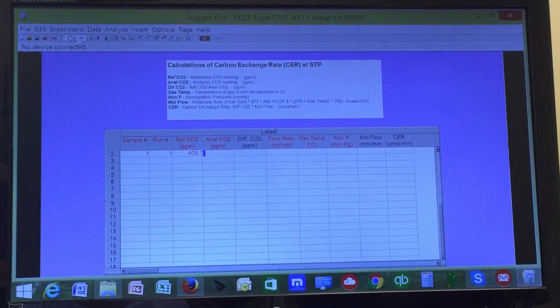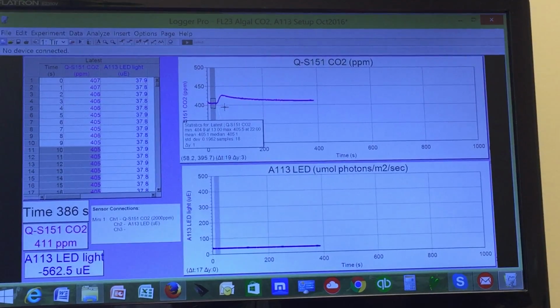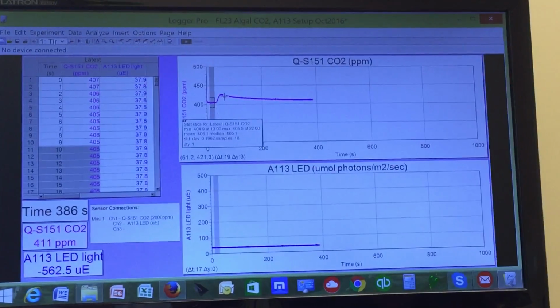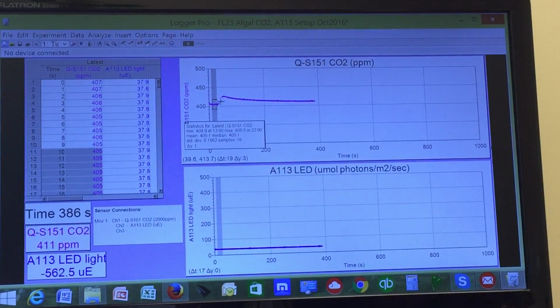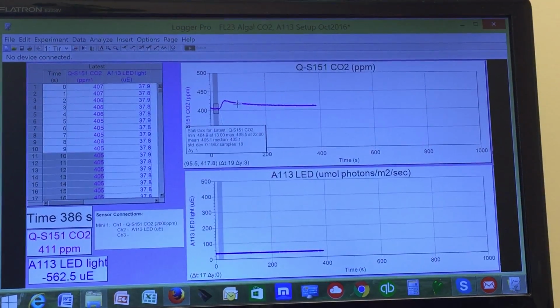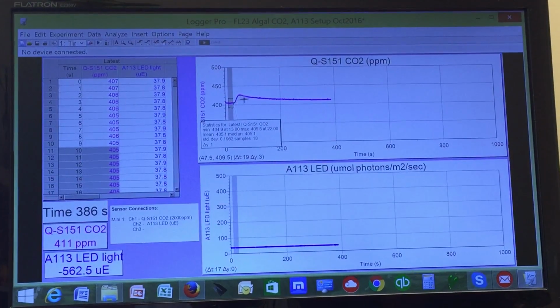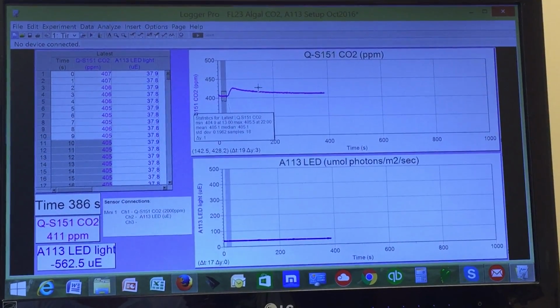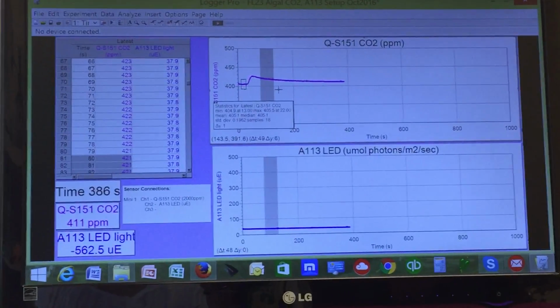Analysis CO2 is the levels that we will obtain from the raw data after the gas is bubbling through your cuvette with your algal culture. And of course, if the light is turned on and you've got algae in your cuvette, CO2 levels will actually drop, not increase, because CO2 is being consumed during photosynthesis. In the dark, you may find that the CO2 levels are going up as your algal culture is respiring without the light. So what you do is you highlight that region of the data.